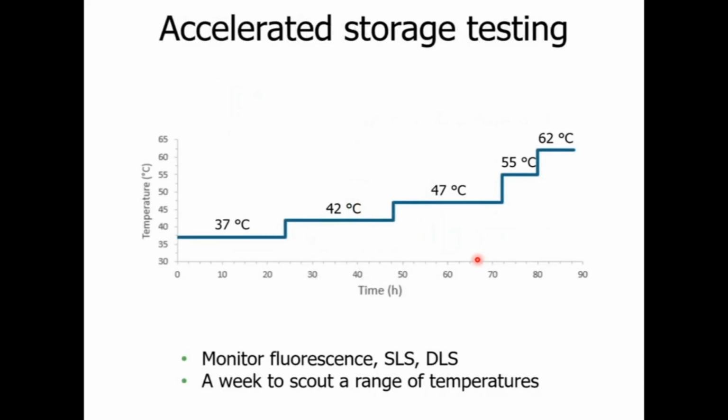Thermal ramps, like we just looked at, are quick and give you a lot of information about your ADC in about 2 hours. However, another important piece of the stability puzzle comes from accelerated stability testing. So in other words, long-term isothermal incubations. The data I want to show you in the next couple of slides are from a series of isothermals that were recorded over the span of a work week. So see it as a scouting study for even longer incubations.